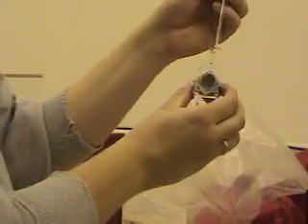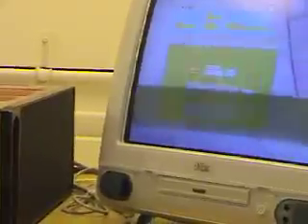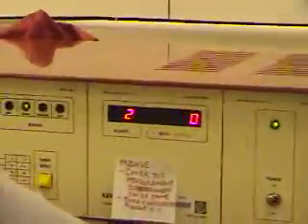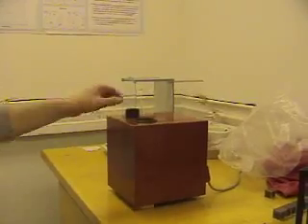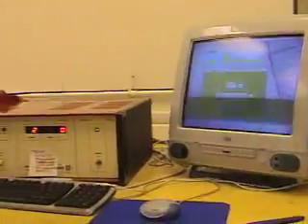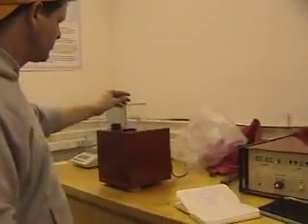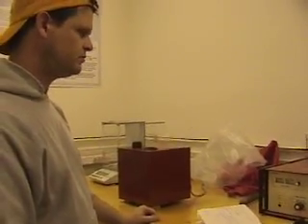So it's loaded in just like that, and this is position one. We're going to measure sample — it says ready in the center here — I go ahead and click measure, and drop it in the sample. And out it comes. Now I'm going to measure position two. It says ready, so we're going to measure. Drop it in. And that's all we do for the measurement. Repeat that a couple hundred times and you have yourself a PhD thesis.